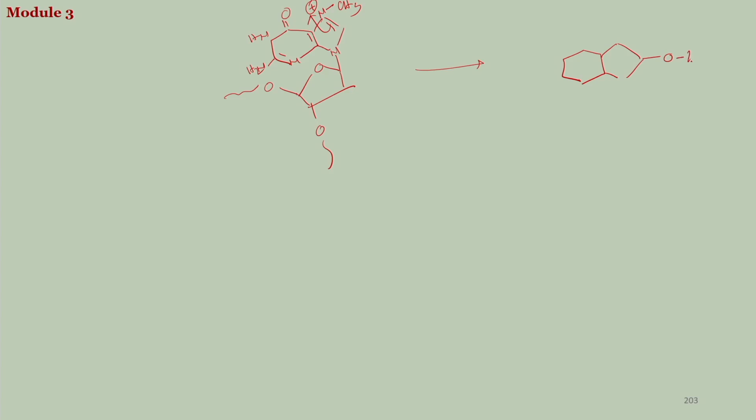there will be water, NCH3, here is your sugar, and here you have this. Now, this forms a ketone and it actually opens the ring up, this breaks this up.